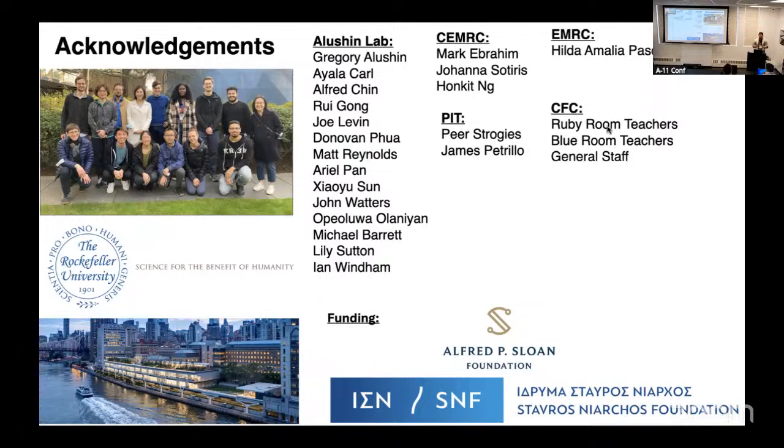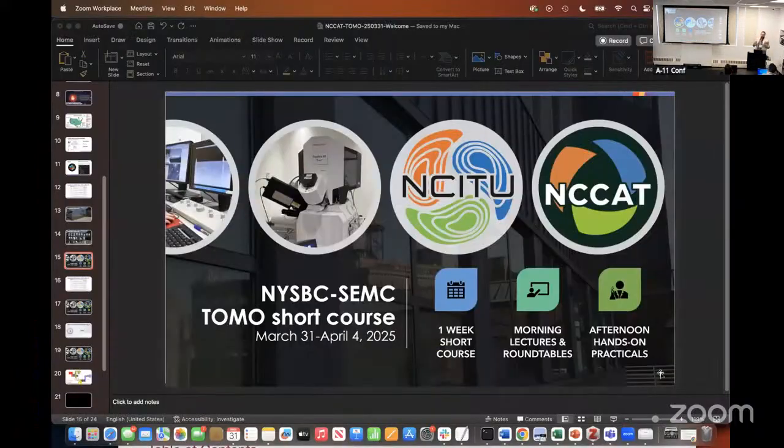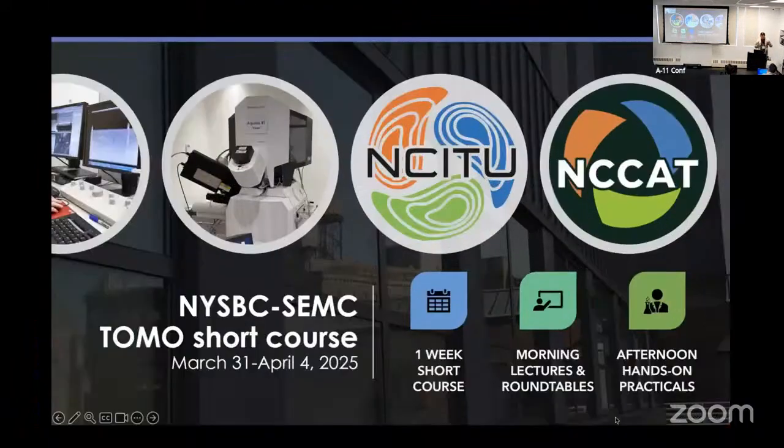I get them aligned because if the grid square is tilted, like a diamond, you basically can only mill a lamella right down the middle. If you go over to the sides, you'll hit a grid bar. But if it's straight on, you can basically run any lamella, but you still have to think about whether a grid bar is in the way. Samples at the top near the grid bar, you can't do. Samples near the bottom of the grid bar, you can't do. You have to go right in the middle, which is another reason why getting the cell or your target positioned right in the middle is so crucial for good milling.